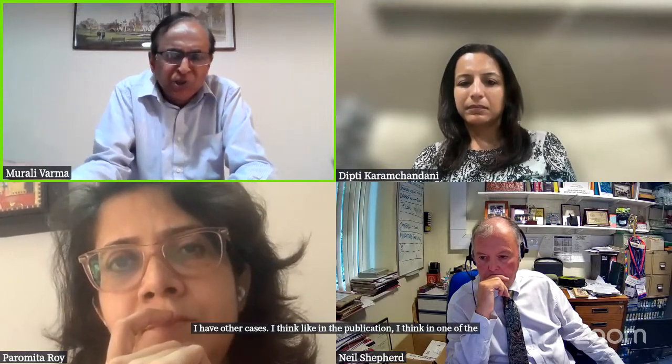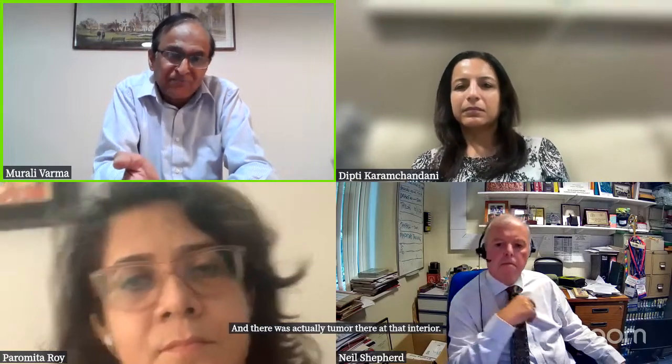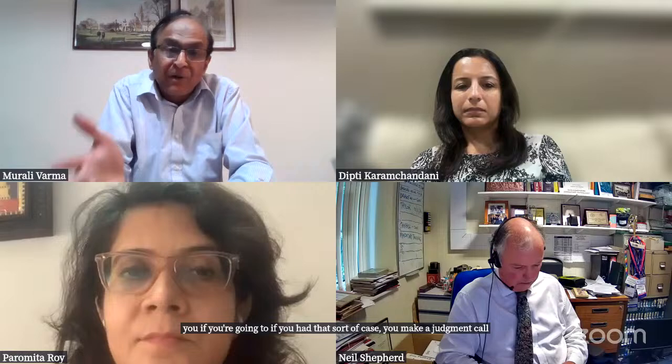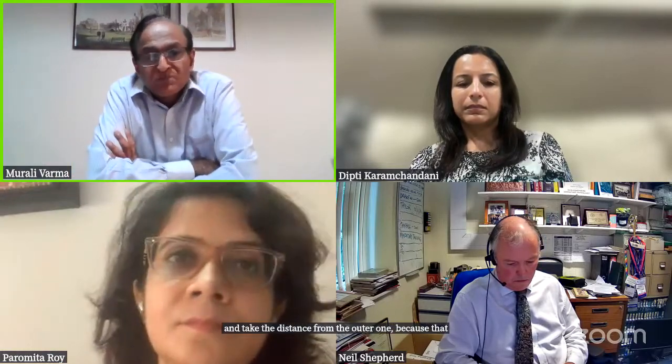So he is saying, when you have a flap, for us in the prostate, we just report margins positive or negative. So we don't give distance from the margin. Okay. But the key thing here is, I was trying to demonstrate that I have other cases. I think in one of the papers, probably the GU paper, there's a case where you had a flap like that, and there was actually tumor there at that inked area on what would have been the surface if the flap wasn't present. So just be aware of that. I wouldn't give separate distances. If you had that sort of case, you make a judgment call, and take the distance from the outer one, because that is what you think is the true specimen margin.